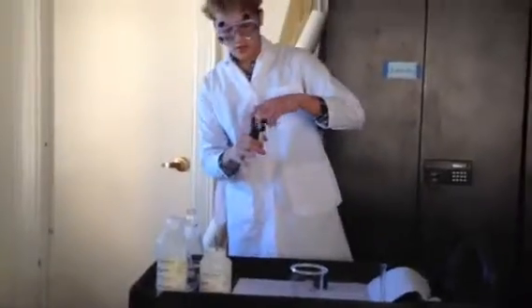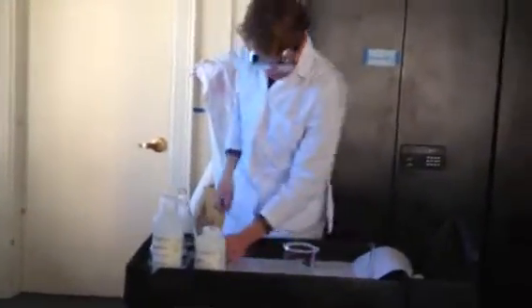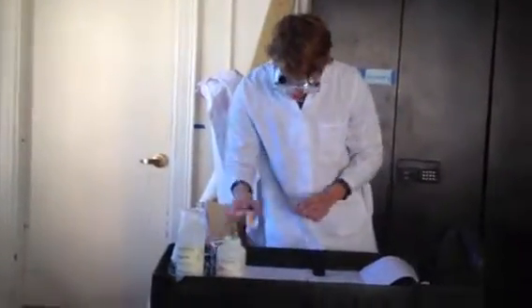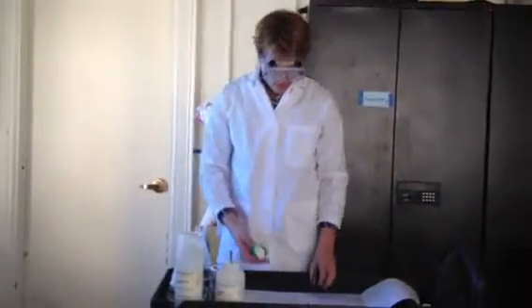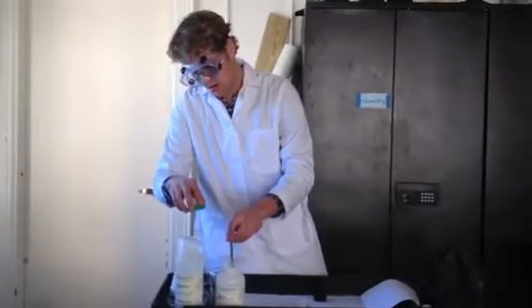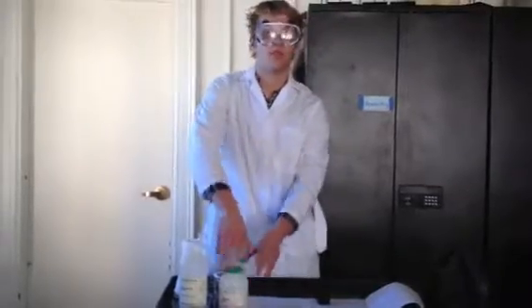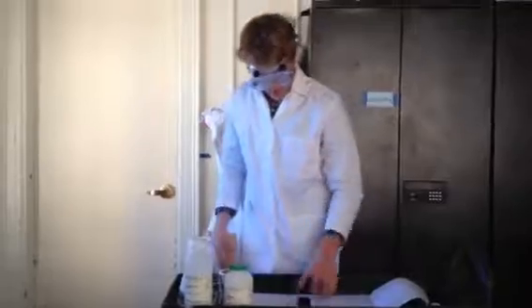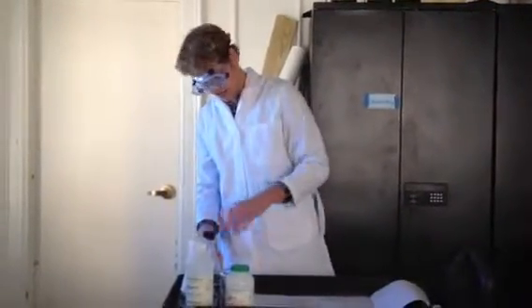And this is why we're going to take our methylene blue, which is an indicator. What's an indicator? It indicates the pH level of water. And it indicates for right around 7, which is right about even, right about in the middle of the pH scale.